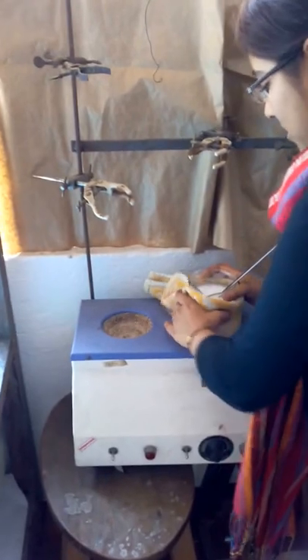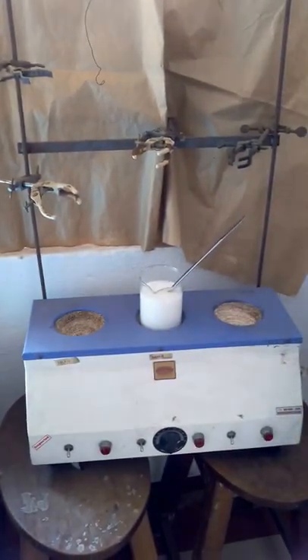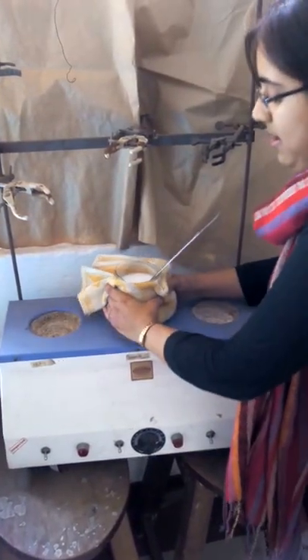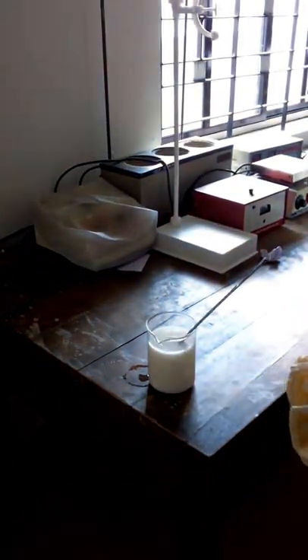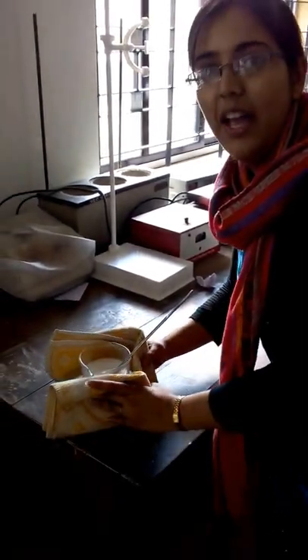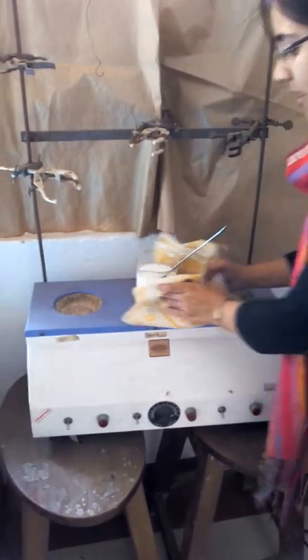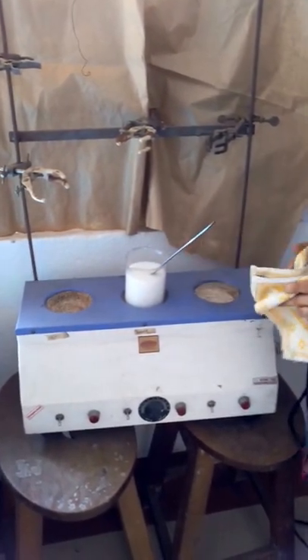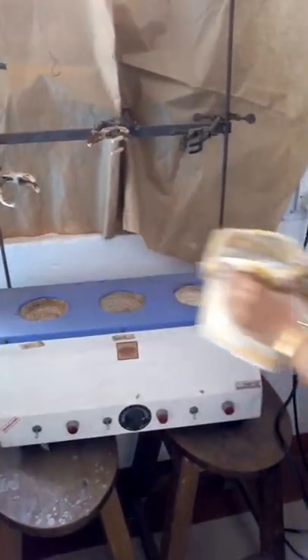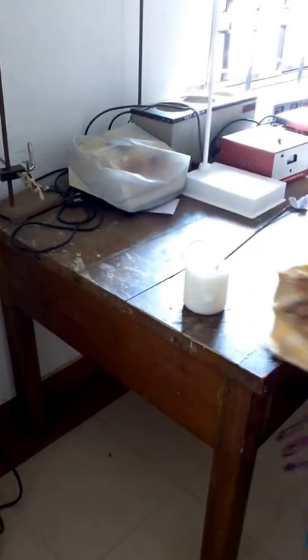We will place it back on the heater for boiling. When it starts boiling, we will again carefully remove it and keep it. We have to repeat the same process a third time — put it on the heater, wait until it boils, then remove it and keep it for 4 hours.